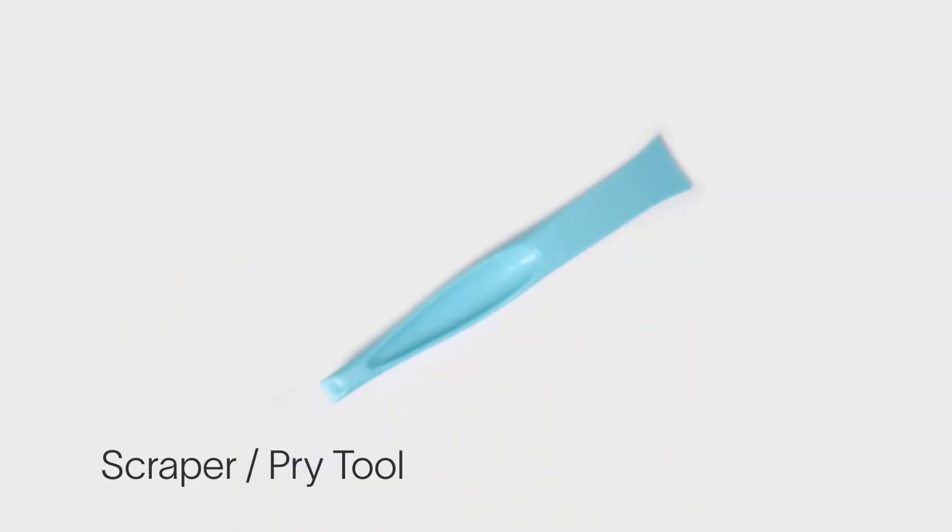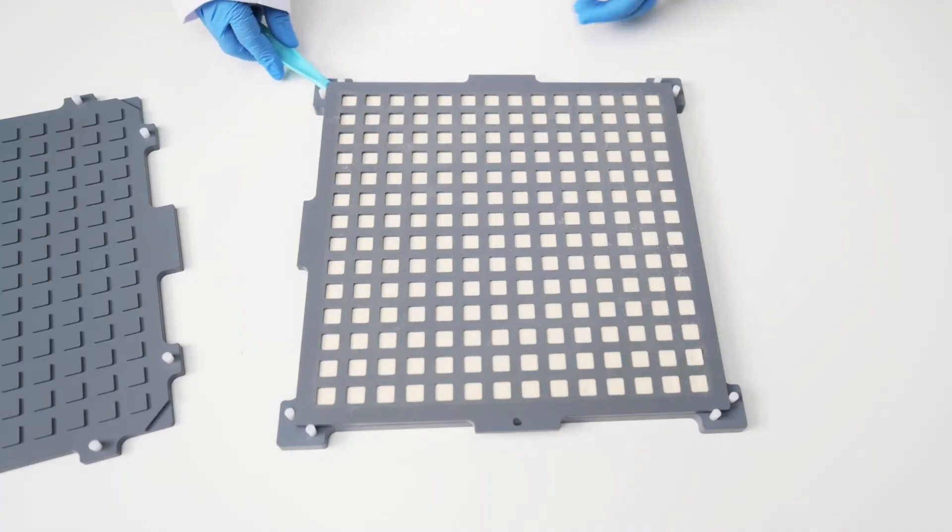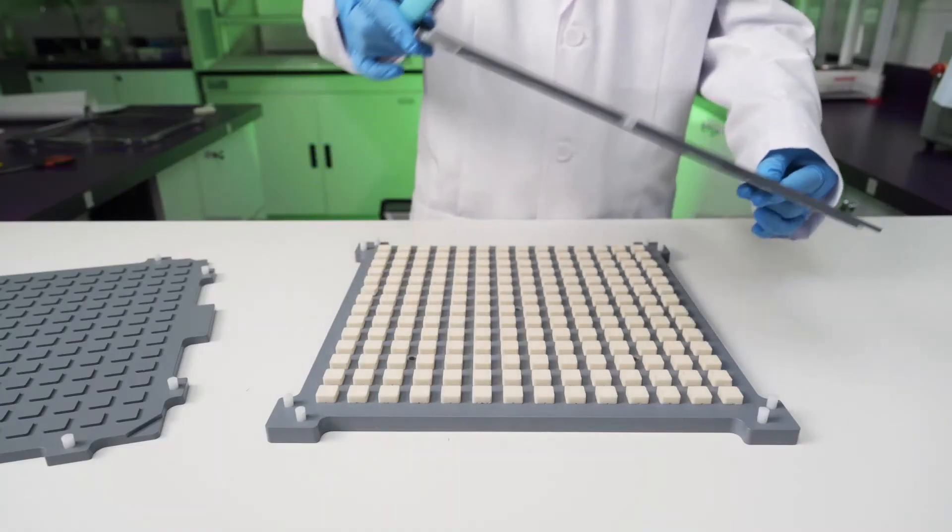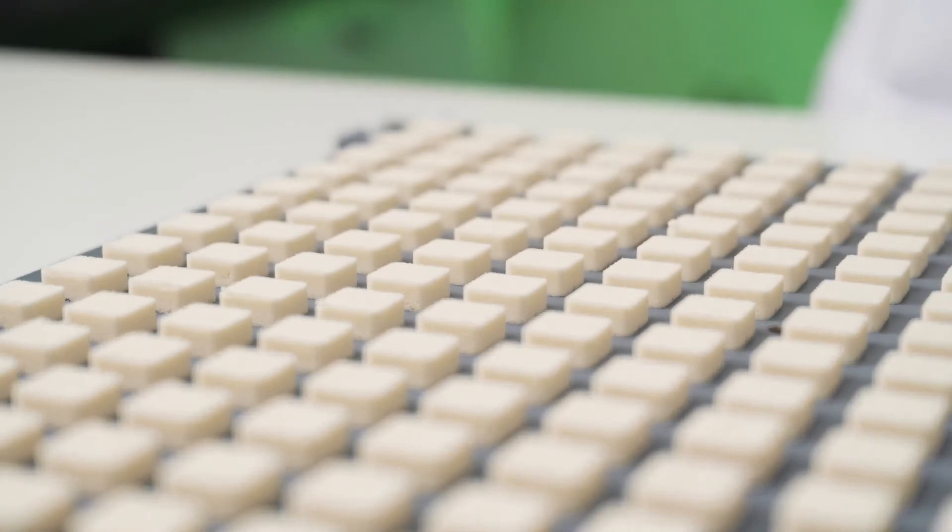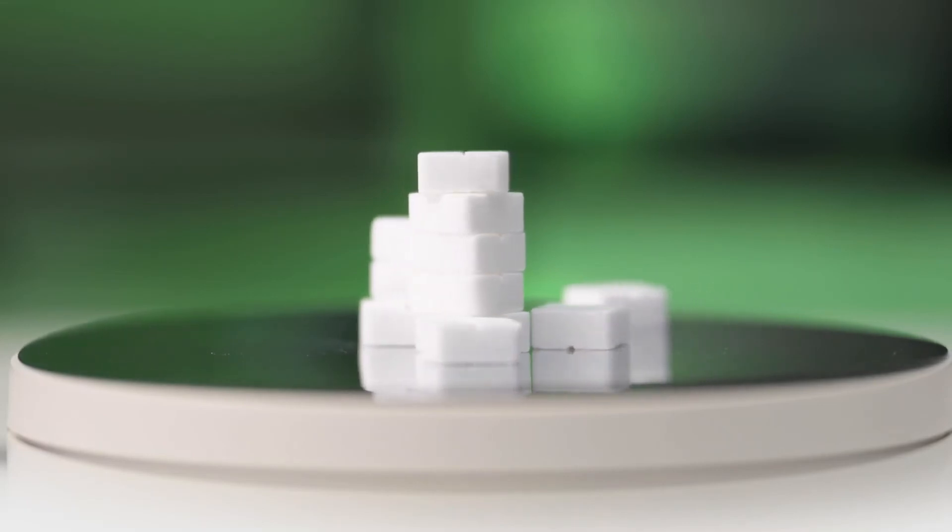Using the scraper slash pry tool, pry apart the cavity plate from the quarter score plate, revealing the batch of RDTs. No knocking or banging to get these tablets out. This system allows you to form, bake, and easily extract perfectly molded, delicate RDTs without hassle or additional equipment.